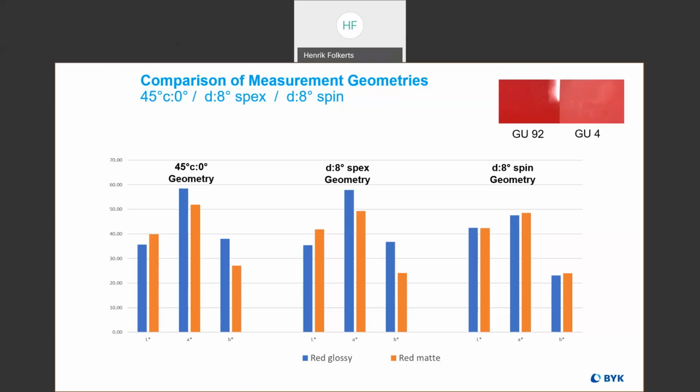Okay. Any other questions here in the remaining few minutes? So I do want to mention that we have a new instrument called the Spectra 2 Profiler that is also a color measurement instrument.